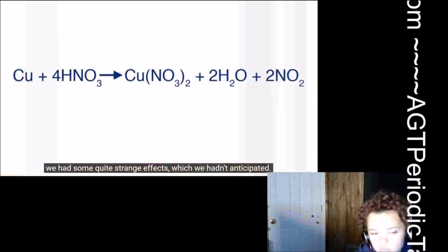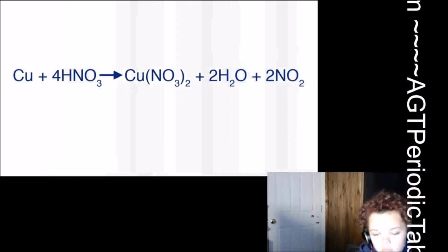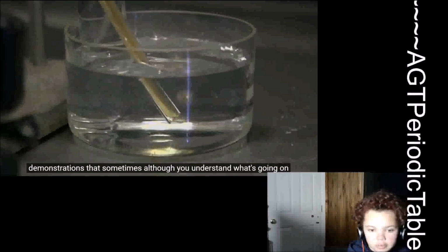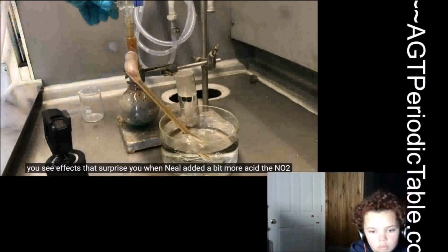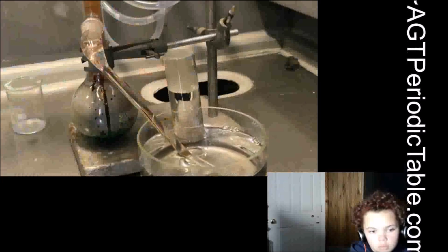Now, we had some quite strange effects, which we hadn't anticipated. It's one of the exciting things about doing chemistry demonstrations, that sometimes, although you understand what's going on, you see effects that surprise you. When Neil added a bit more acid, the NO2 started dissolving in the acid.